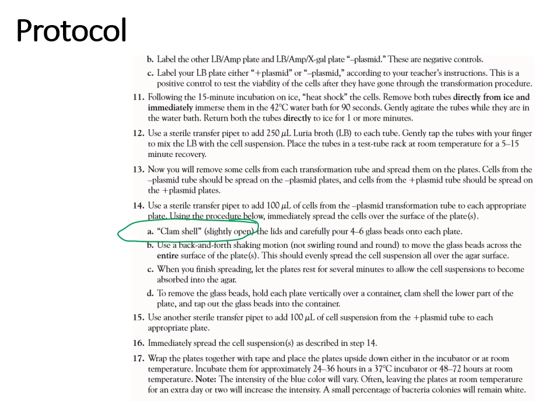Whenever you are plating samples, always make sure to use the clamshell technique. Okay, that's what we use not just in microbiology and genetics, but in all of our different scientific fields, because that minimizes contamination. What that means is you never completely open an agar plate cover.